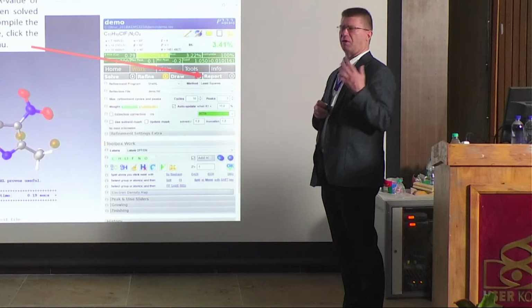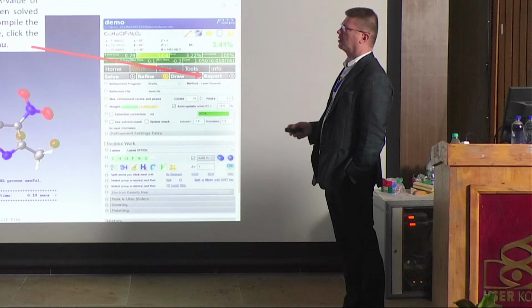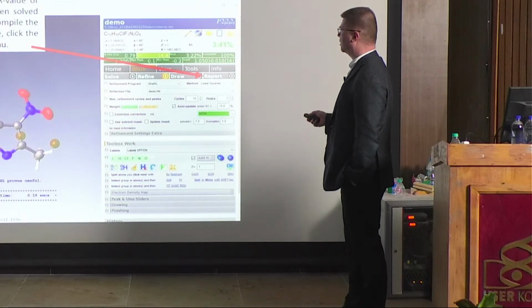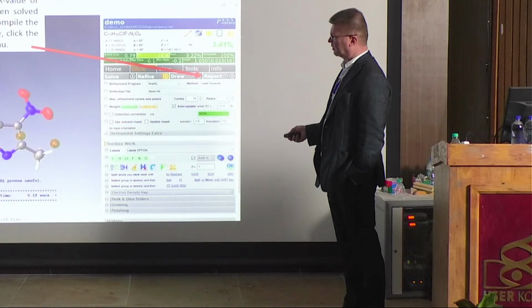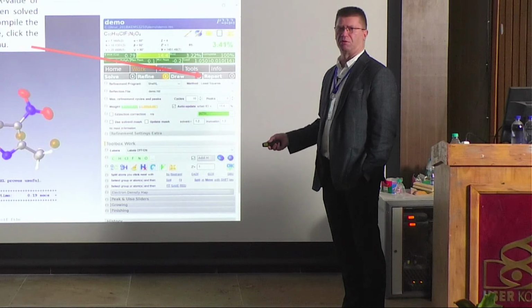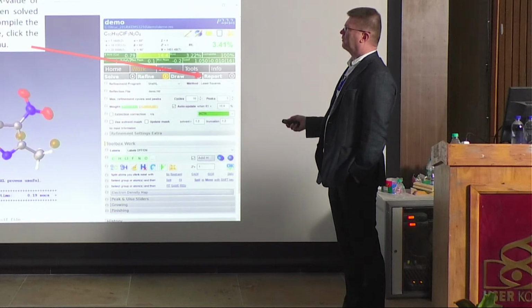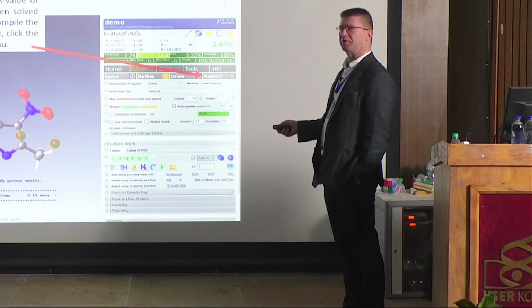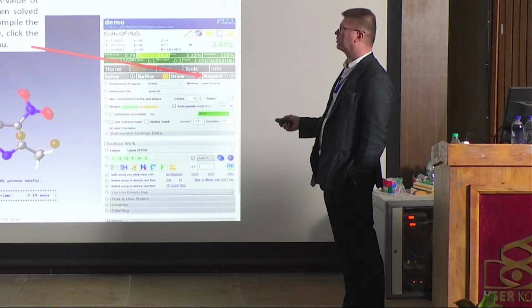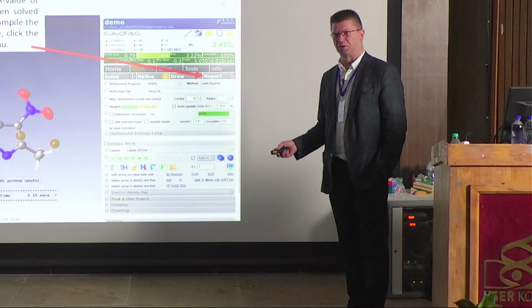So what do we do after we have done the X-ray structure? Now we have the finalized X-ray structure, and we are happy with it. Everything has gone green. All the atoms are correct, and these here are the background. We don't have to worry about them, so everything's fine. And now we have to do what we normally do. We make tables out of it. We call them crystallography tables.